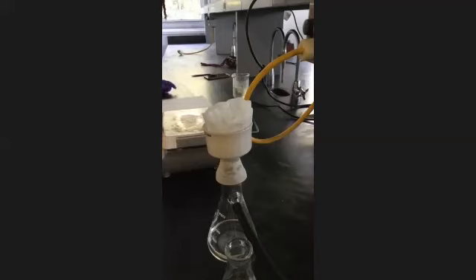While that's filtering, this is my favorite part of lab, clean up. Do you want us to calculate this one? You can look it up, but since it's catalytic and it's just such a small amount and it doesn't react, all you're gonna need is the molecular weight and the density.